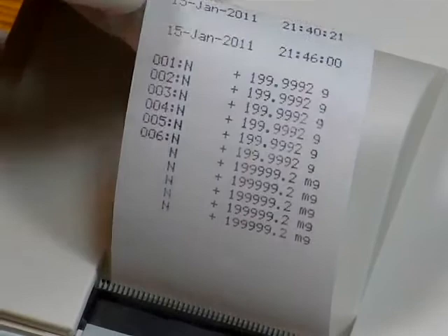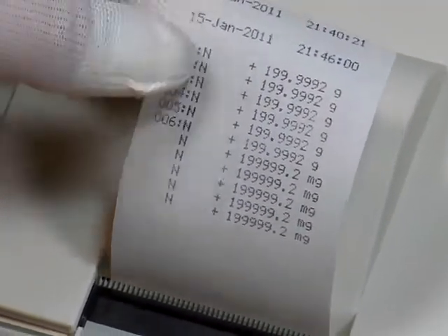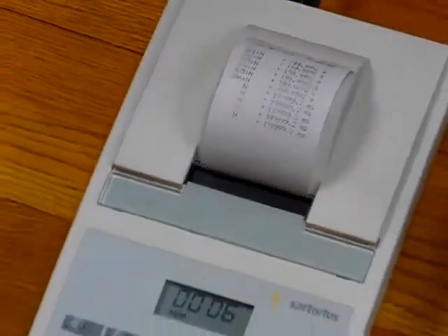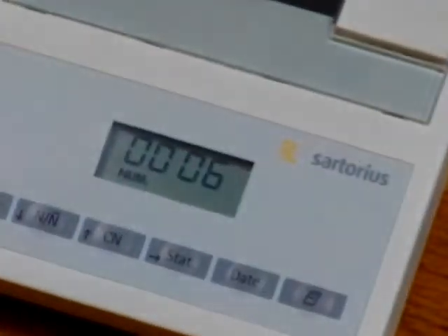Looking at the printout, the beauty of this printer is that it's GLP compliant — it shows the date, the time, the weight, and the sample number. You can see where we were in grams and then switched to milligrams. This is the Sartorius CPA324S. We have this balance in stock for immediate delivery. It comes with a three-year limited manufacturer's warranty and the balance is made in America.